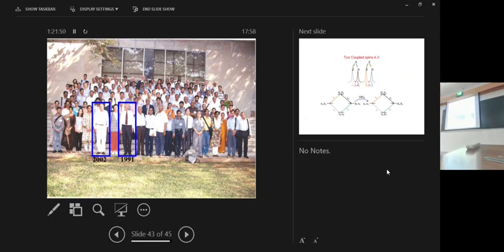We can see NMR on elements other than carbon too. Wherever there is a magnetic moment, you have an NMR signal. If the spin I is equal to 0, then you will not see it. Carbon-12 has spin 0, therefore you don't see carbon-12. But carbon-13, nitrogen-15, nitrogen-14, all of these are visible. A spin half nucleus is what is mostly important for biology and chemistry.